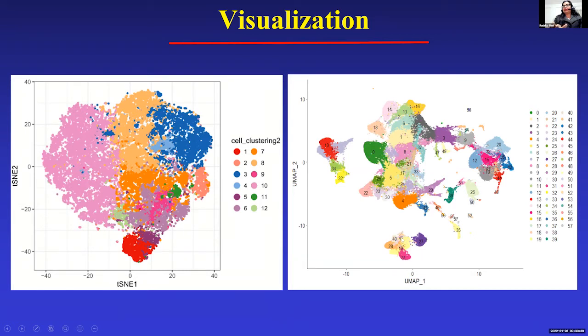as compared to how dissimilar they are from the ones which are different, which are clustered a little at a distance from these clusters. For example, this cluster below, 40, 45, 27, 28, 19, and 31, are close together. So this means it might be one cell subtype as compared to the others which are not so close to this one.